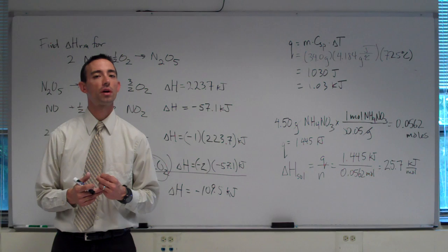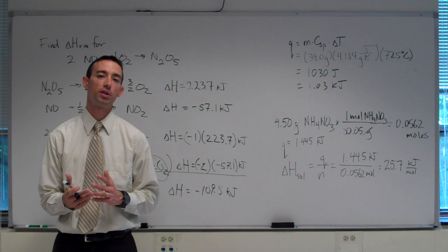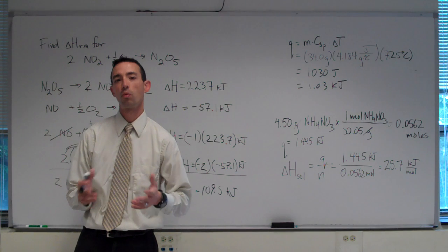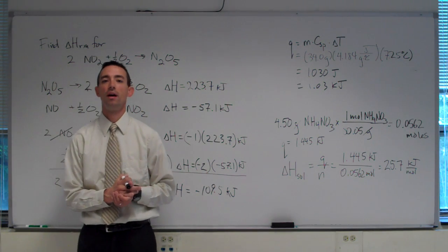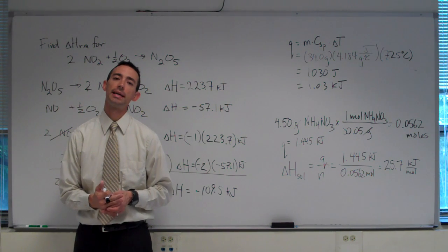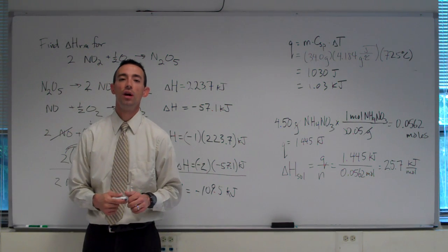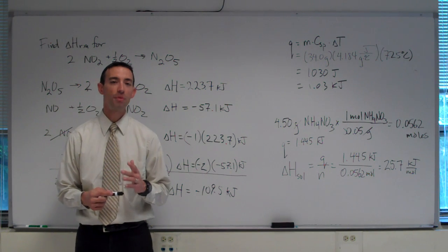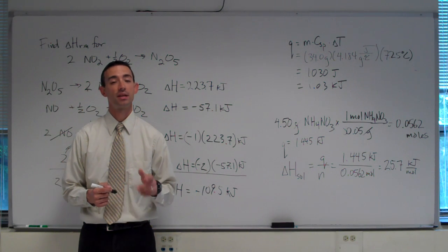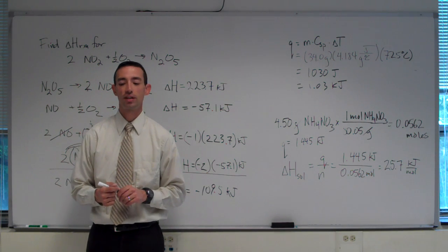The acid is not strong enough to directly burn you as soon as it gets on your hands, but this is always a personal issue. Everyone's skin has a different sensitivity to acid. So if you're worried, you might want to wear a pair of gloves in today's laboratory. As always, if you do get any acid or any chemical on your skin, you would want to immediately proceed to the sink and copiously rinse the affected area with water for a couple of minutes to clean that area, and seek your instructor's help if anything should happen.